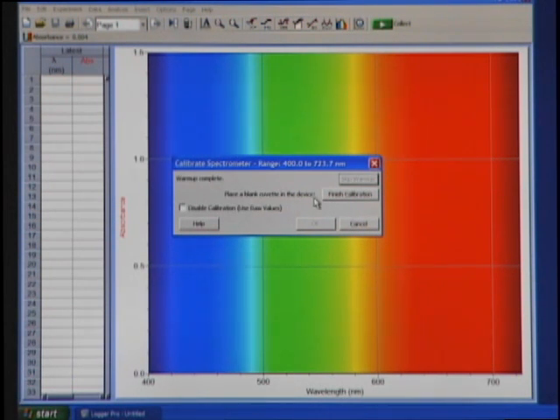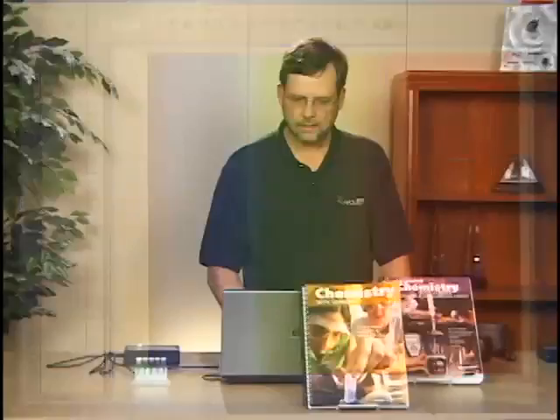It says to place a blank cuvette in the device and finish the calibration. So we click on that, and we click on OK, and the calibration's complete. That's all there is to it.